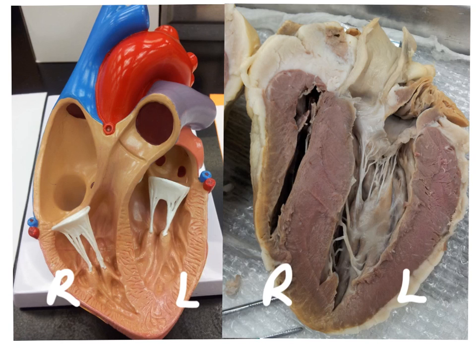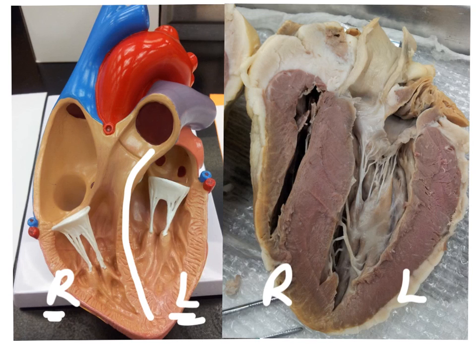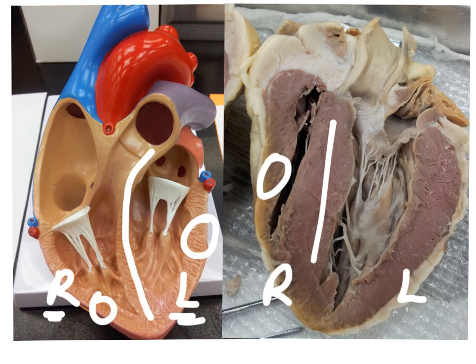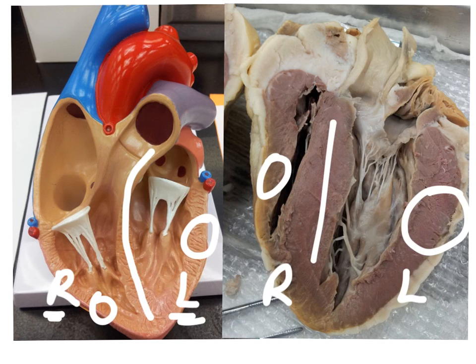Taking a look at the frontal section of the heart model, let's determine what view we're looking at. We're looking at an anterior, ventral view of the heart, so that makes this the right and this the left. Here is the septum that divides the left and the right. Pay attention to the thickness of the myocardium — much thicker in the left because it has to be a much stronger muscle to pump blood to the body versus just to the lungs. So when you're looking at a section, determine where the thickest wall is and that will be the left side of the heart.